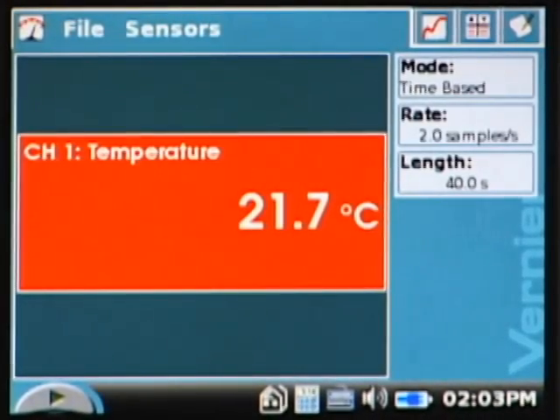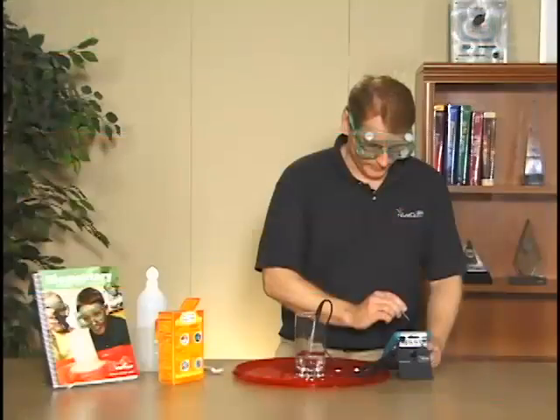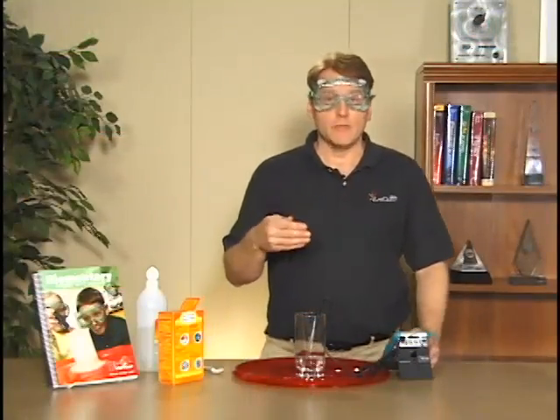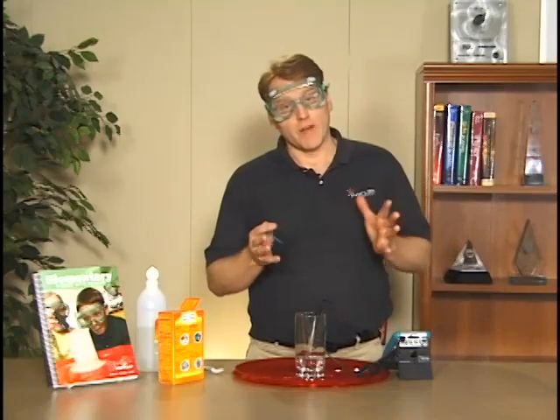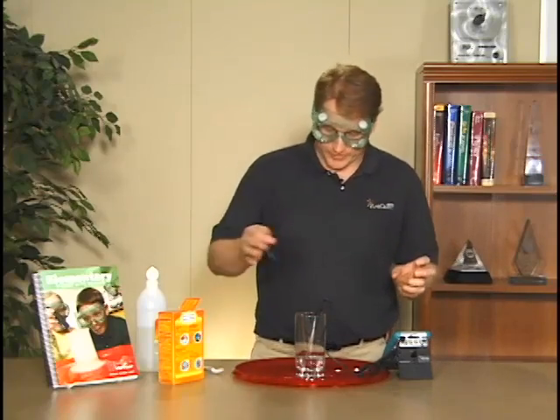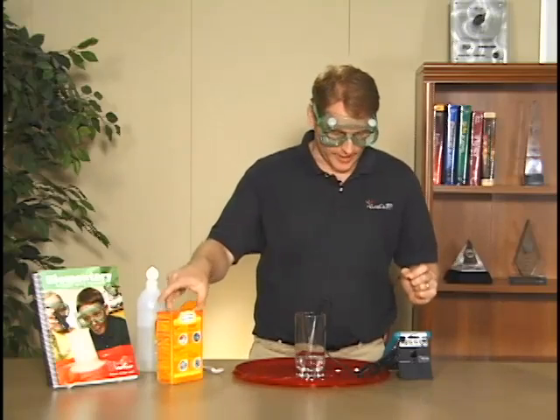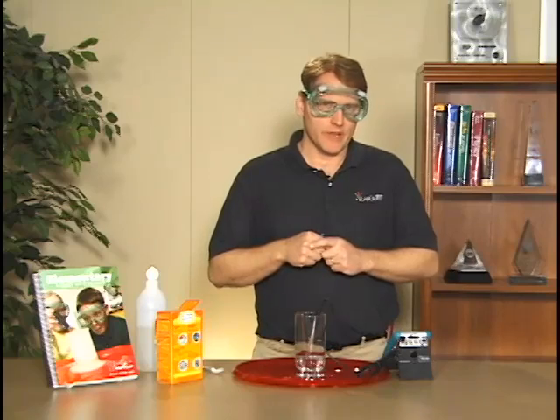I'm now ready to collect. The lab says to start collection for about five seconds before we actually add the other reactant.